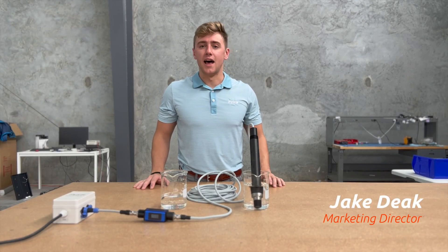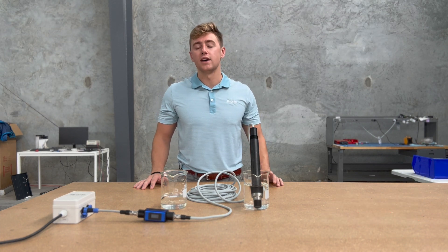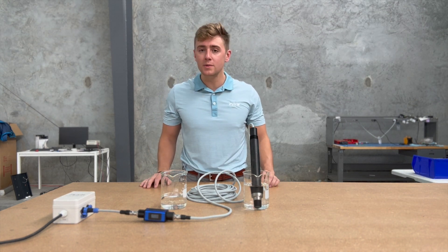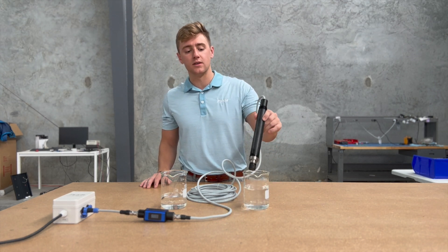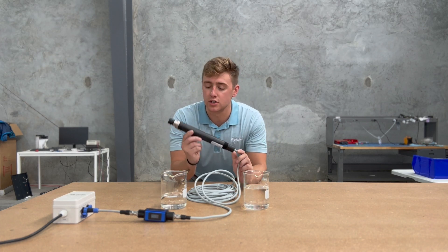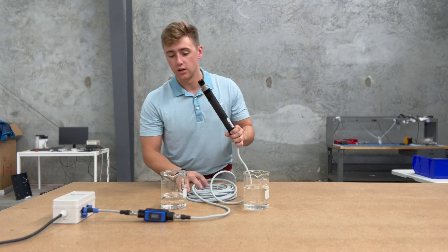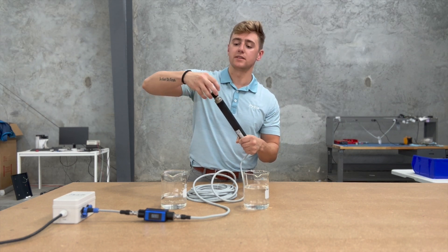Hey everybody, it's Jake Diak with Pyxis Lab. Today I wanted to break down the ST772 DO dissolved oxygen series. These are luminescent dissolved oxygen sensors. I have the ST772 P here — this is the CPVC plastic version. It's a lightweight sensor with a long cable and an anti-scratch DO membrane cap that's a simple twist on, twist off.